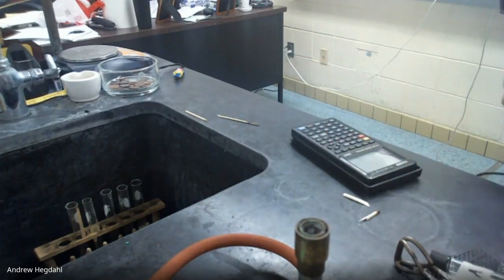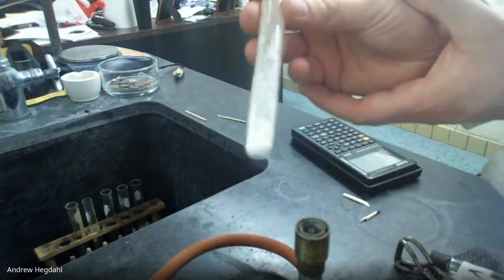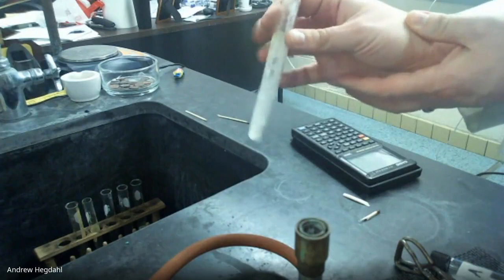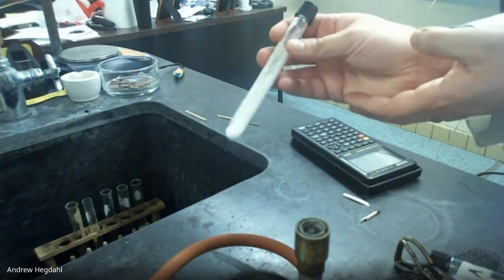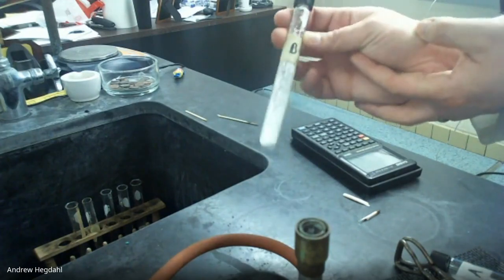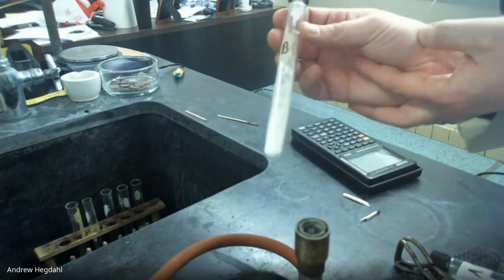Are you guys good? I can move on, or are you not quite ready? Marley, you can move on. All right, here's B, kind of out of focus, but it has kind of the texture of flour. I tip it, it kind of tumbles like flour. It's kind of fine grained. So sample B, like white crystals with a flour texture.